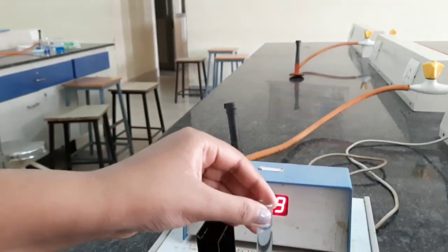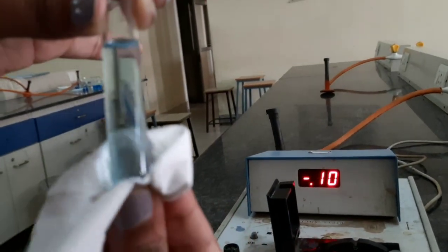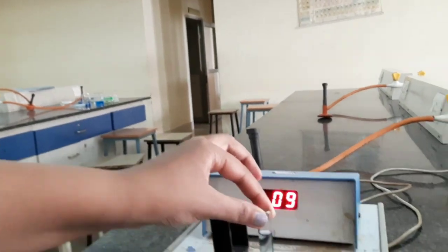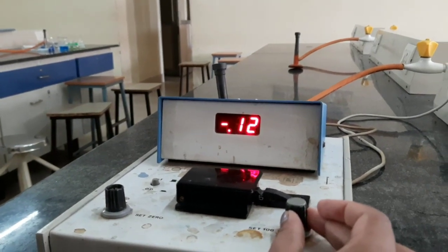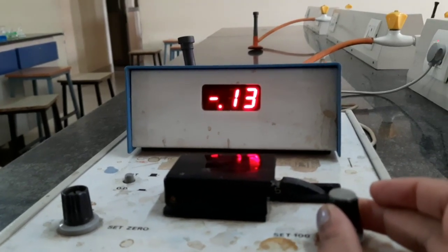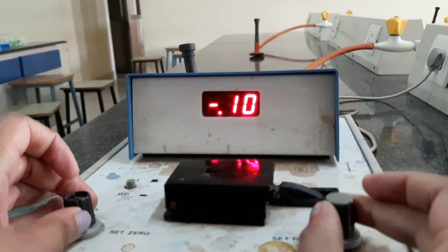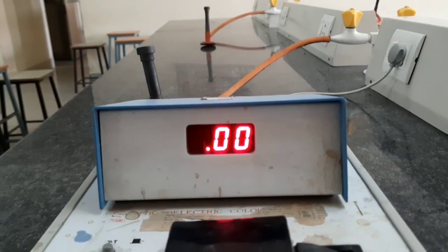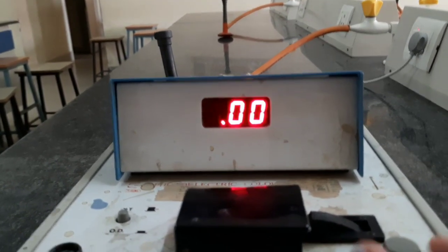Then we have to set the OD value to 0 with our blank. Before that, it is very important for us to clean the cuvette on the outer side. So we are going to set it to 0. Now you can see that we have set the colorimeter to 0. The blank is set to 0.